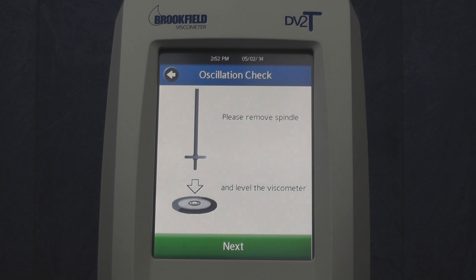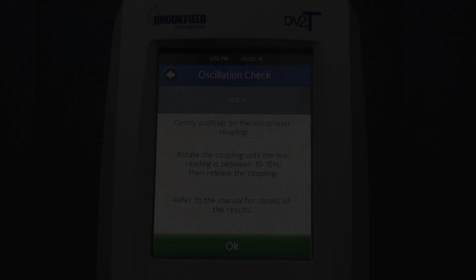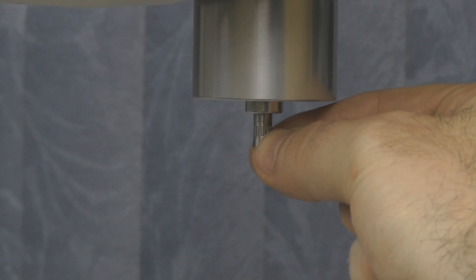Once removed, press the next button and follow the directions on the screen. It is important to lift up on the coupling nut before increasing the torque to 10 to 15%.